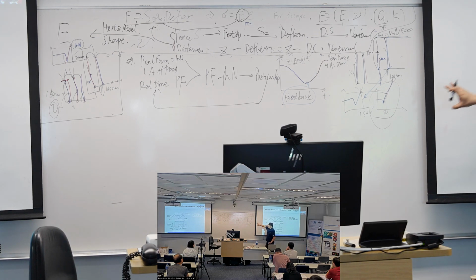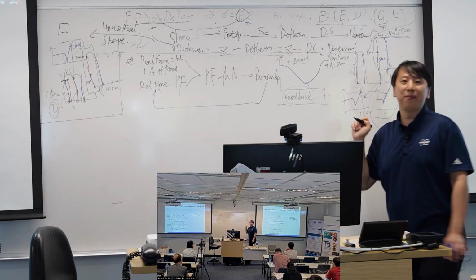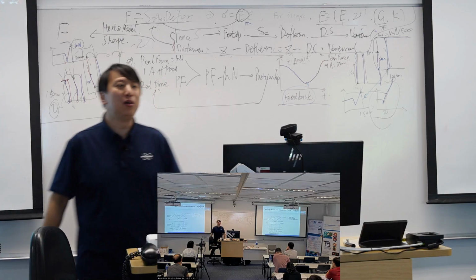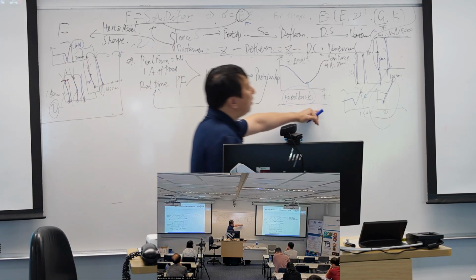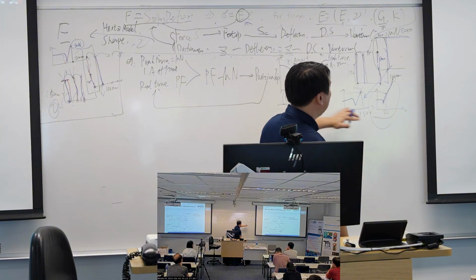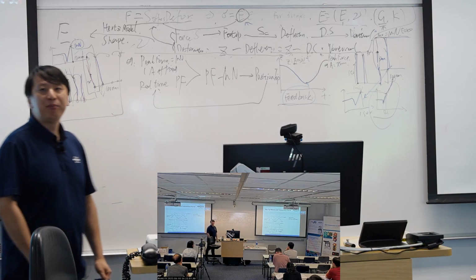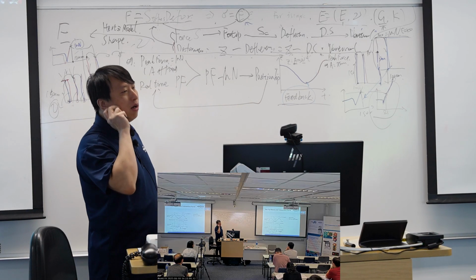But the good thing about this mechanism is we can make it fast. But this one is kind of slow, it depends on the speed. Here we sacrifice the force at several points, but the good thing is we make it fast. So that's the feedback mechanism of PeakForce tapping.